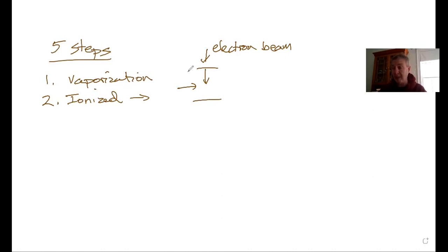What the electron beam, or we used to call it, get this, an electron gun, does is it knocks off an electron. So if your molecule enters here, what exists here is a molecule with a plus charge. Where does it knock it off? It really doesn't matter. Any molecule that loses an electron will be positively charged. Now, once you've got it in this, it's now positively charged.